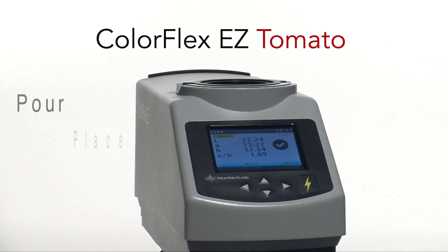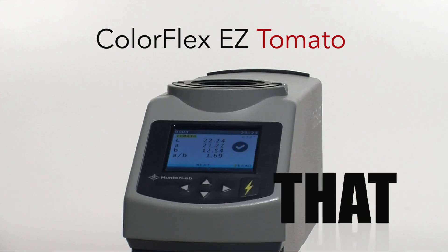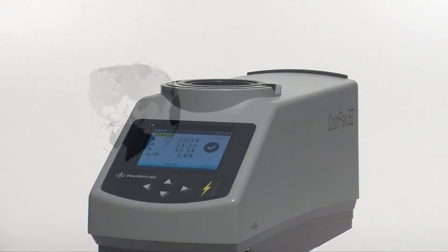Pour. Place. Measure. It's that easy. And only from Hunter Lab.